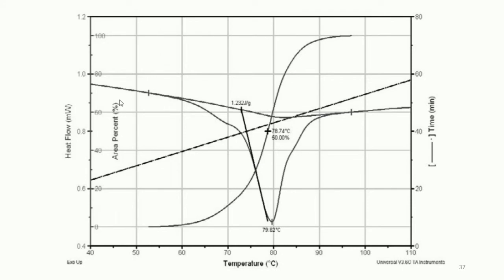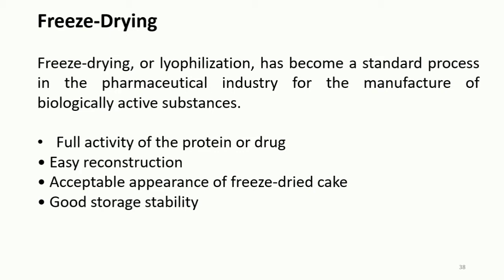And next one is the freeze drying. Freeze drying or lyophilization has become a standard process in the pharmaceutical industry for the manufacture of biologically active substances.